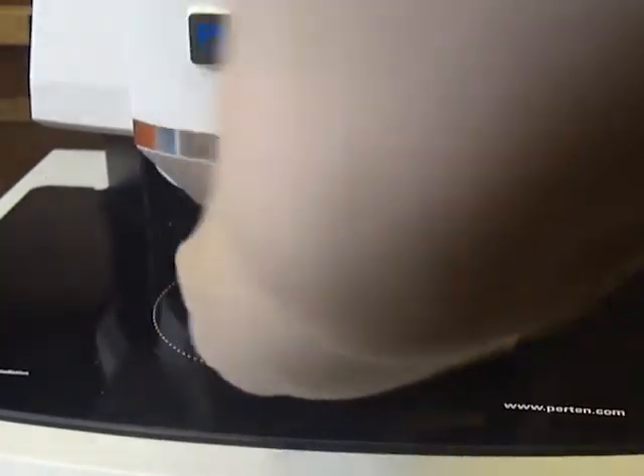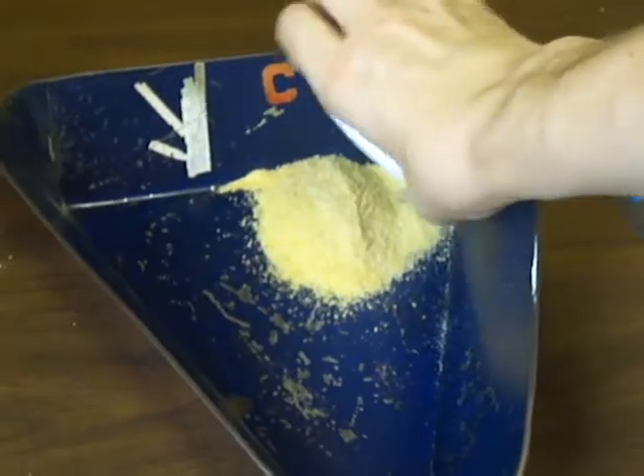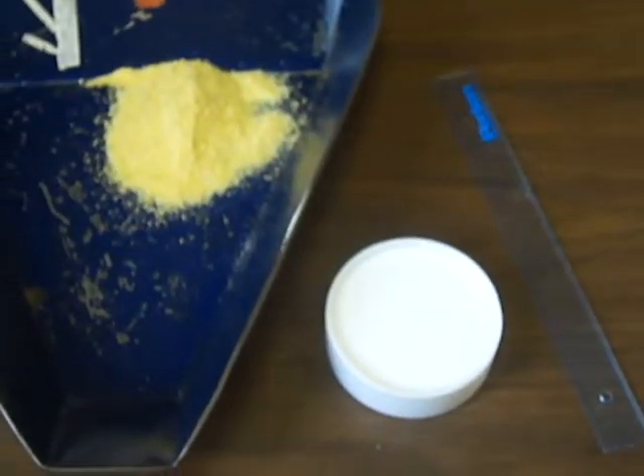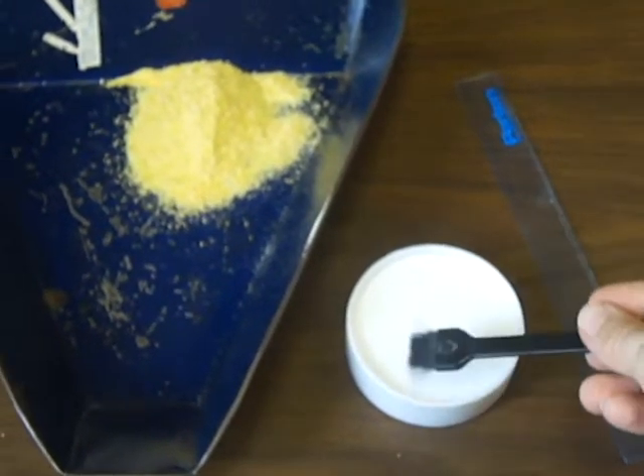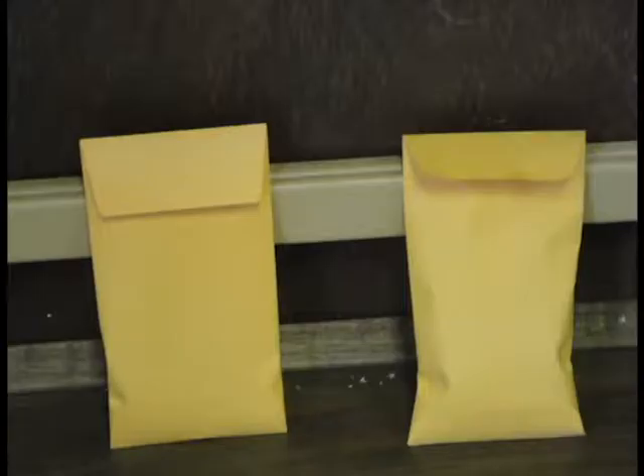Remove the sample from under the light and dump it into the tray. Pour it back into the envelope and use a brush to clean the meal out of the tray and the cup. Once they're clean, move on to the next sample.